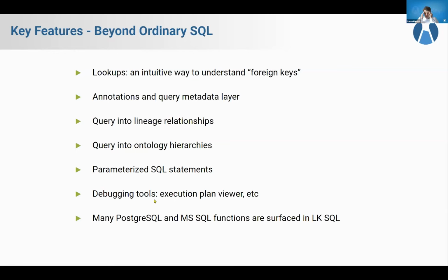If you don't know what I'm talking about, don't worry about it. You just have to understand the concept of a lookup, which is really shot through the entire server and is really pretty easy to understand, I think.